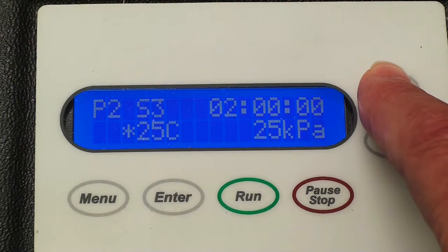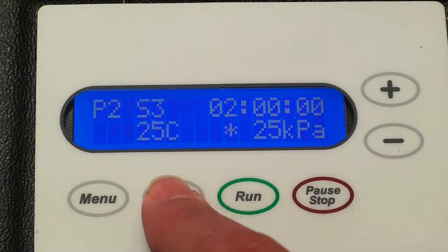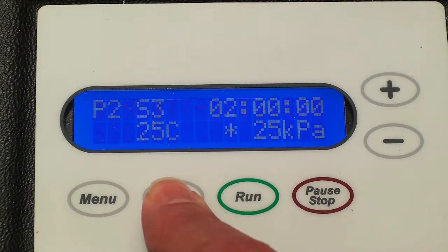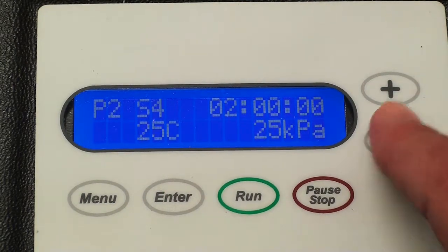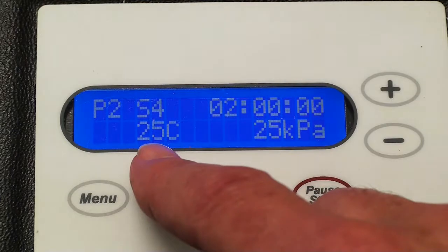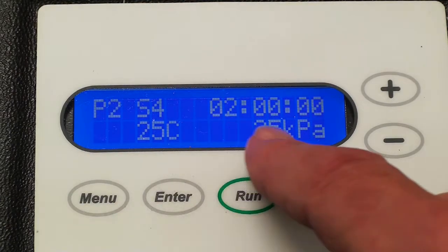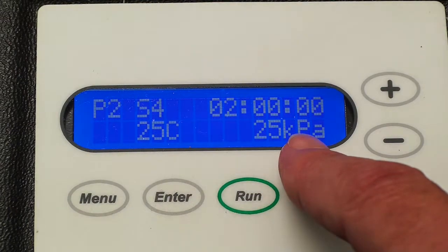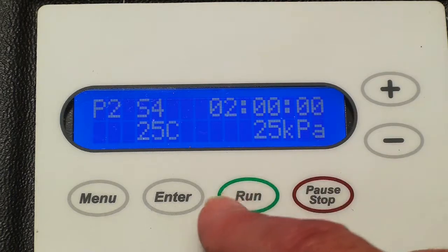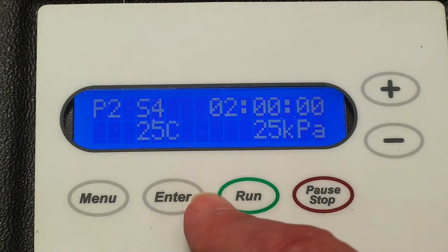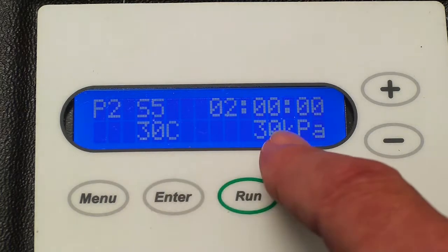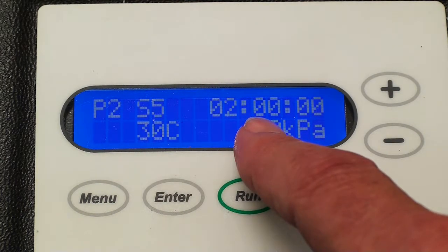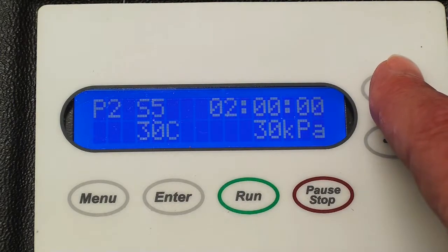25 kilopascals, you see we're decreasing the pressure, increasing the vacuum, however you want to put it. And that's again step 4, 2 hours, 25 degrees centigrade and 25 kilopascals. And then the final step, 30 degrees, step 5 for 2 hours with the 30 kilopascals.